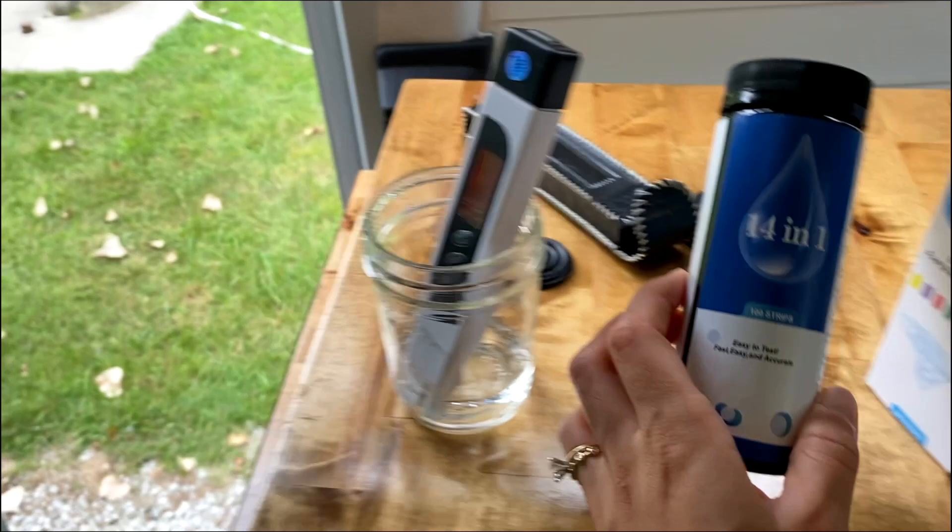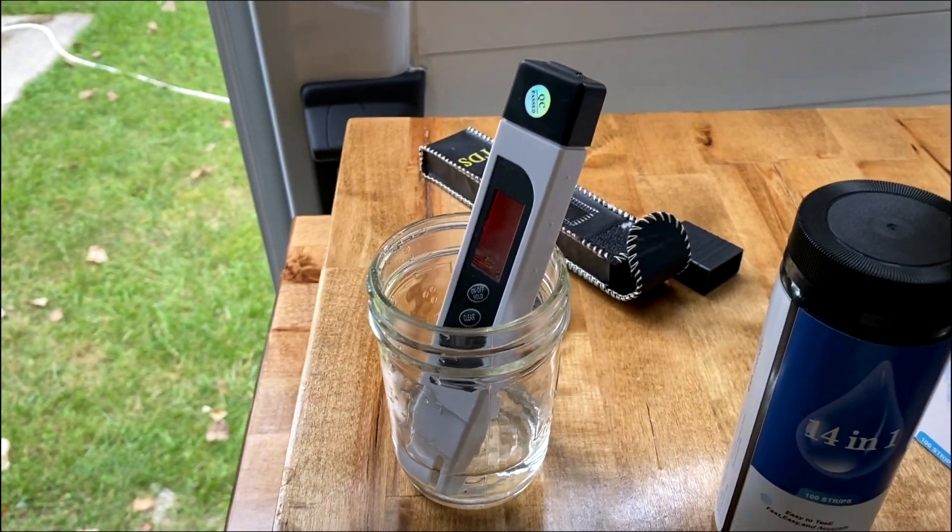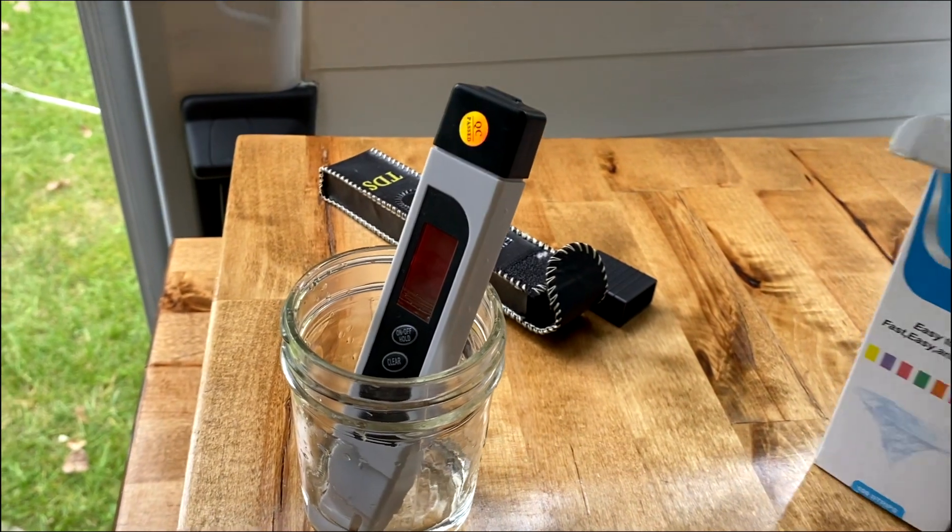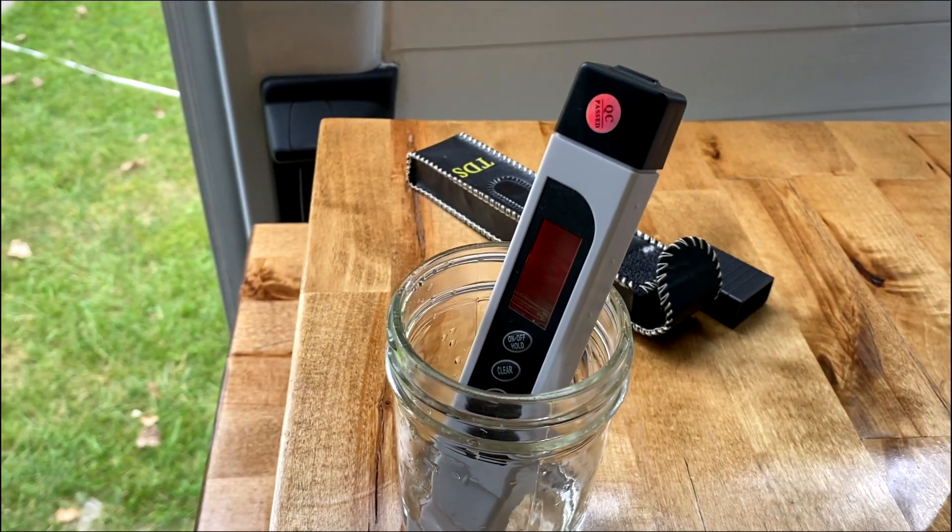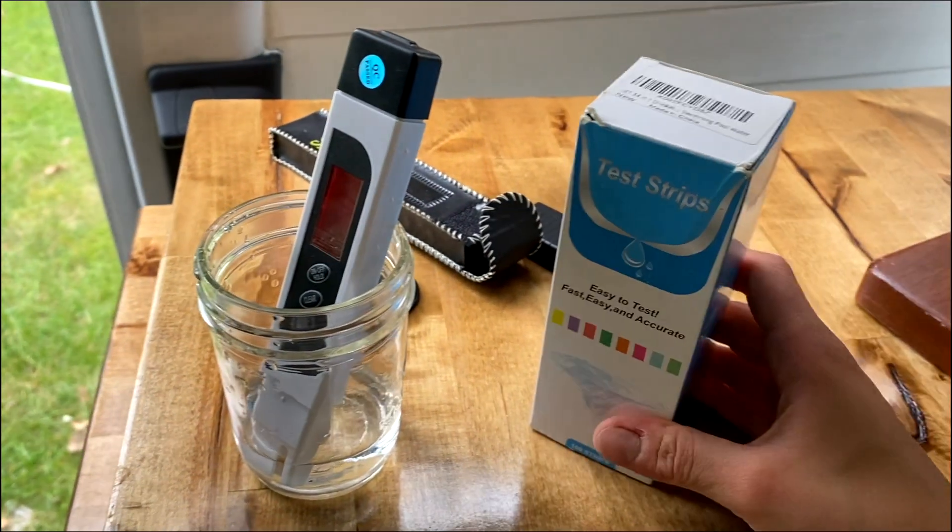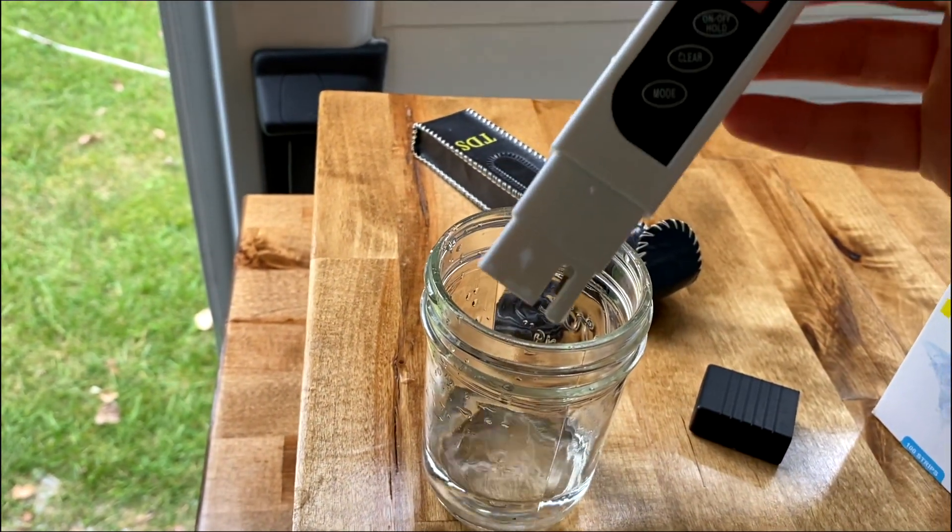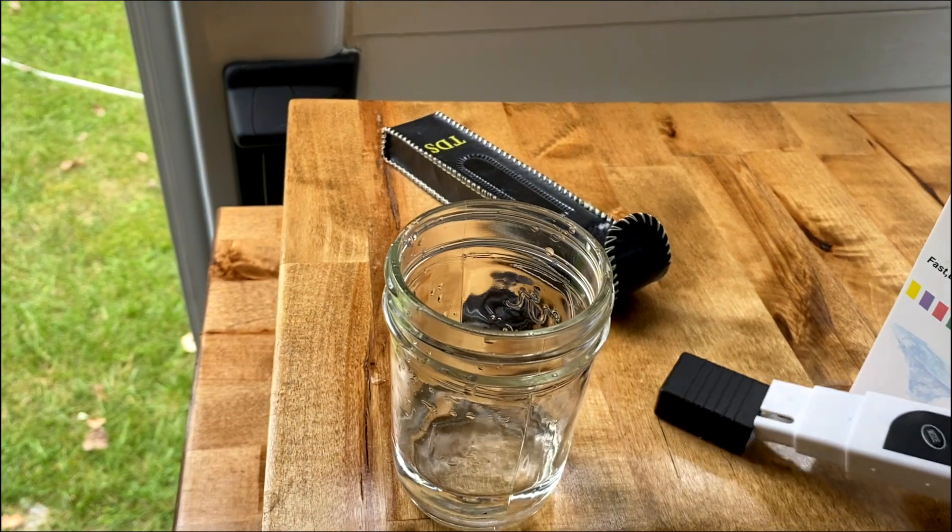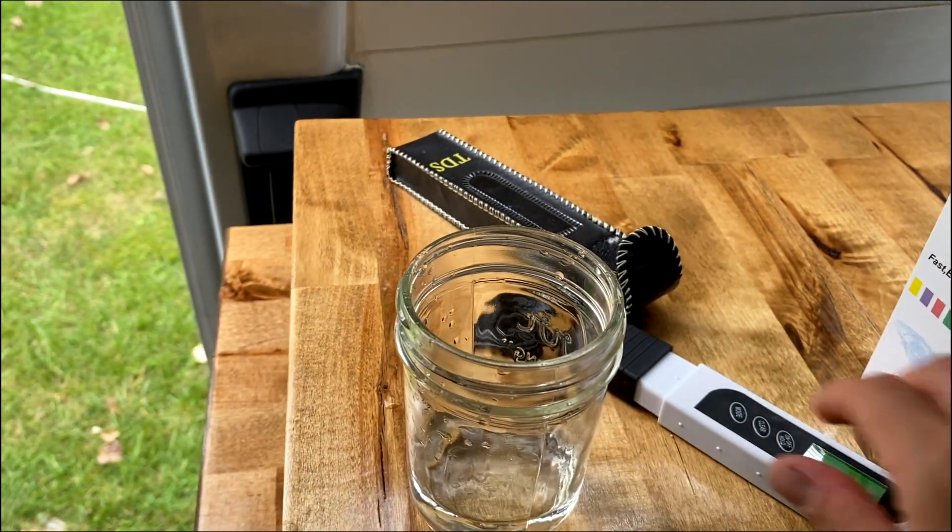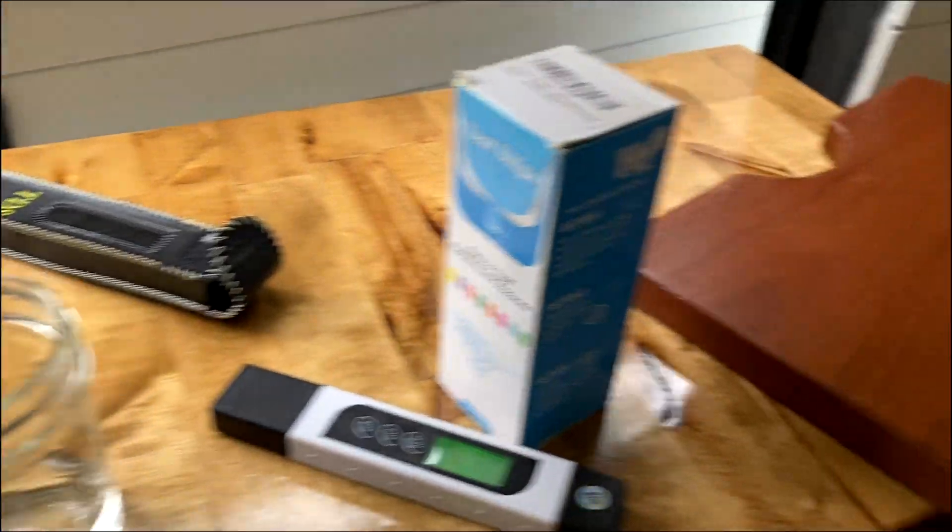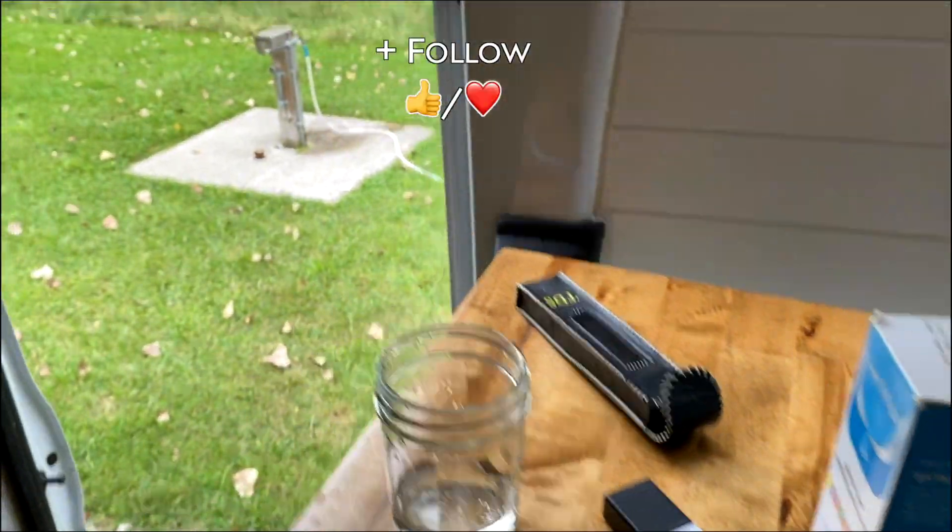So with this and the TDS meter, you can kind of get an idea of the purity of the water, which of course, even with these two, you should not rely that the water is a hundred percent pure because we all know that there's so many contaminants in water nowadays. So many contaminants and water is so precious.